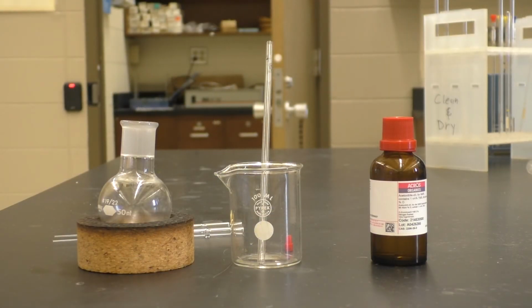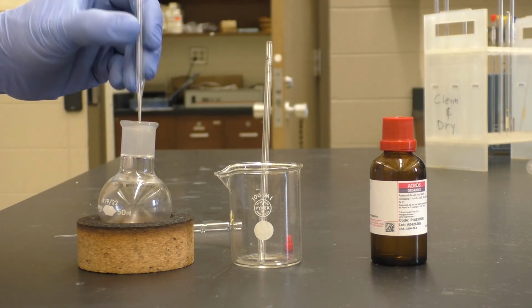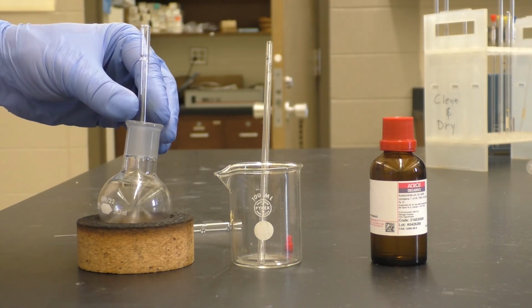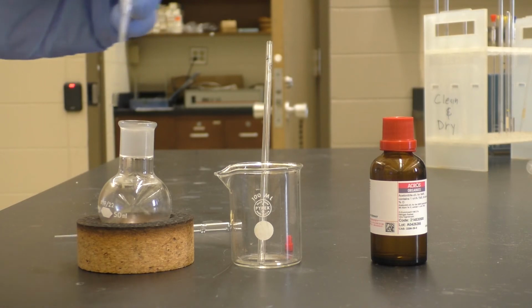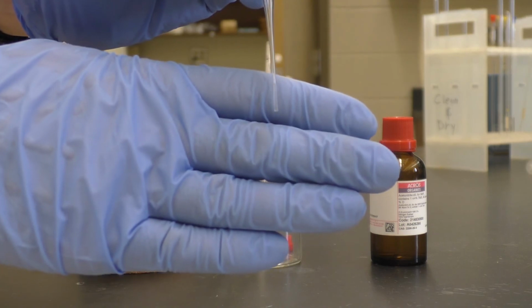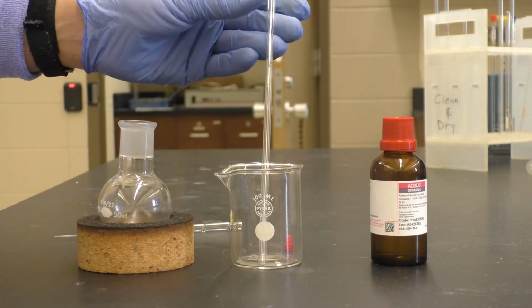We'll prep the NMR sample very similarly to how we prepped the previous NMR liquid samples. So we'll take a small glass pipette, dip this down into the oil, make sure that we pull some up by capillary action. We've got a little bit there in the tip. Don't need a lot, but I do have some there in the tip. Then we'll simply place this into the NMR tube.